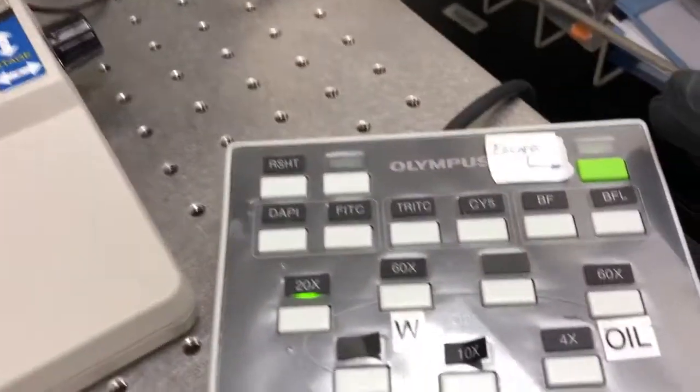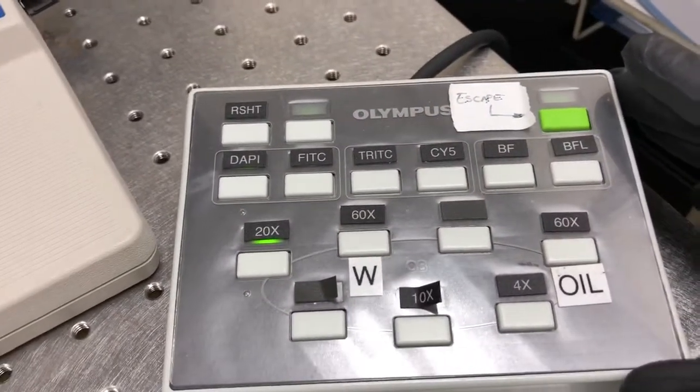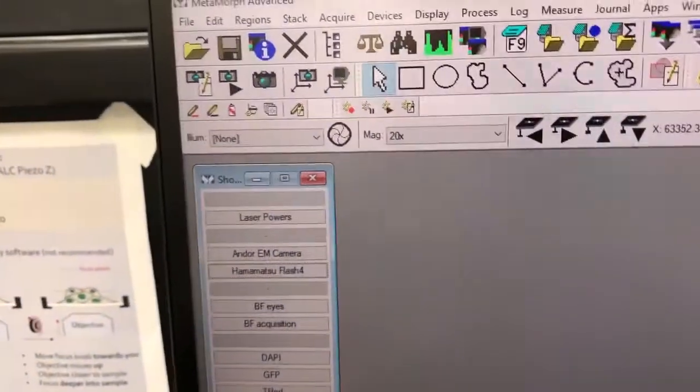On this keypad, we can change objectives, which we can also do by clicking here.